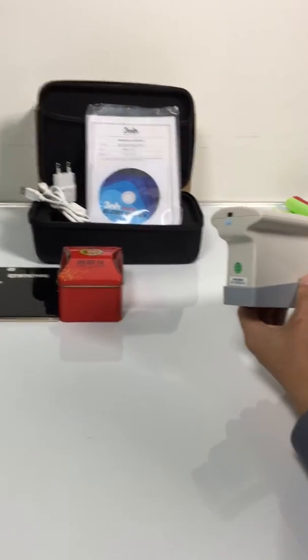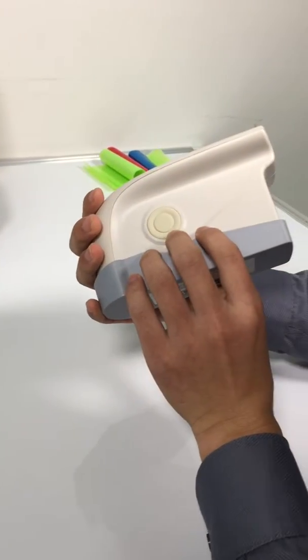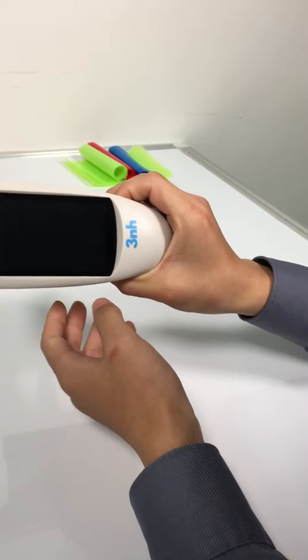This is the GlossMeter NHG268. This is the main button. We press it for three seconds and it switches on.